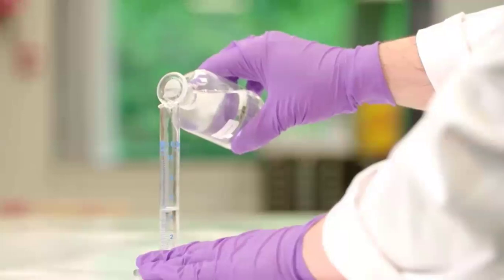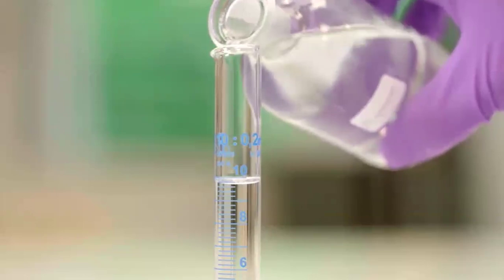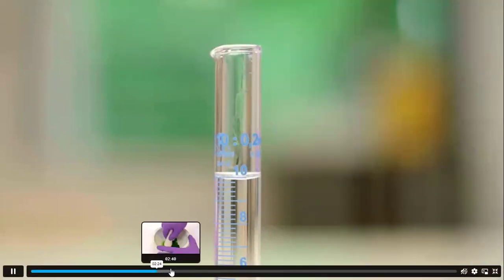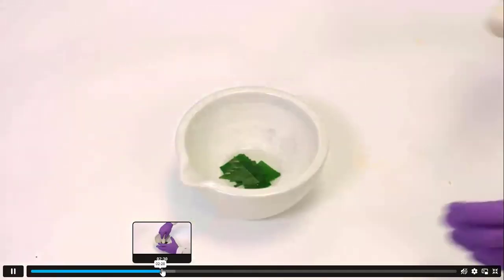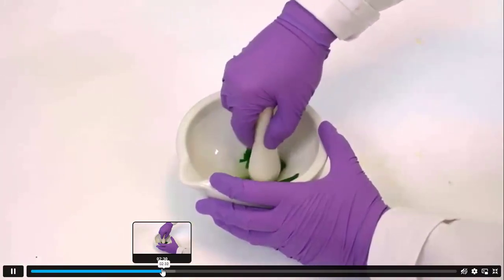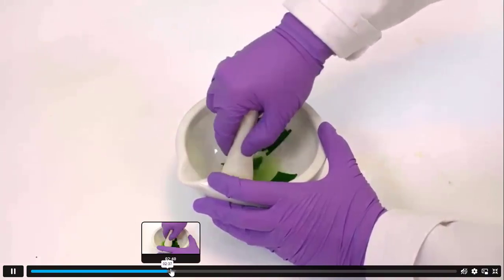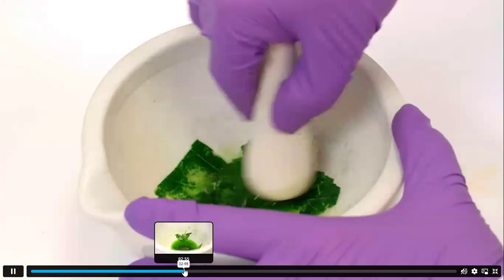A measured volume of alcohol will be added. Now they're going to crush so that the cells will be crushed and we get green pigment. And we are going to find out how many different components are there in this green pigment, right?